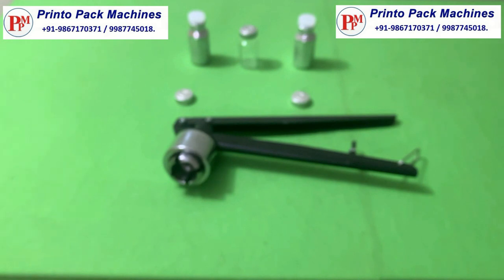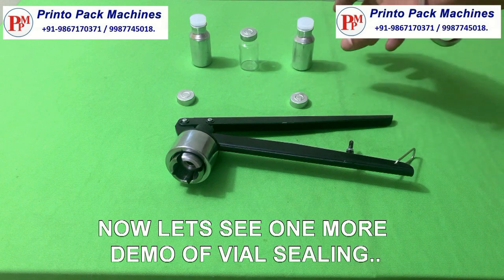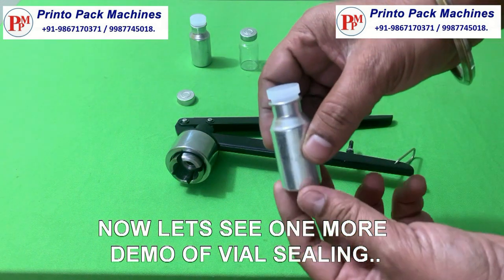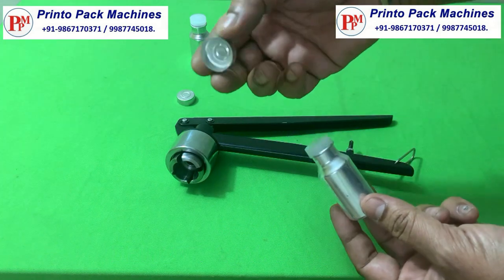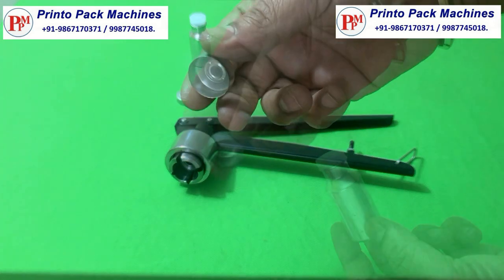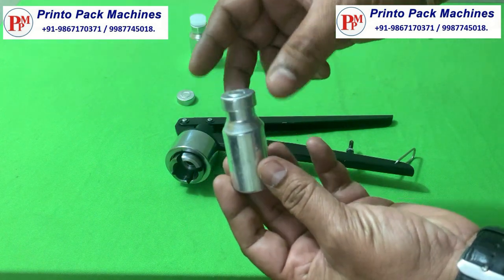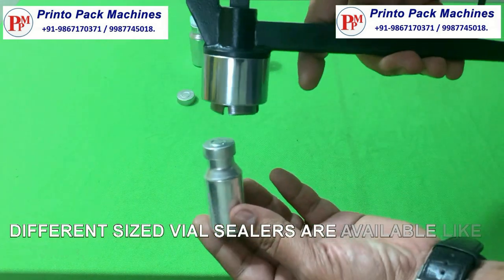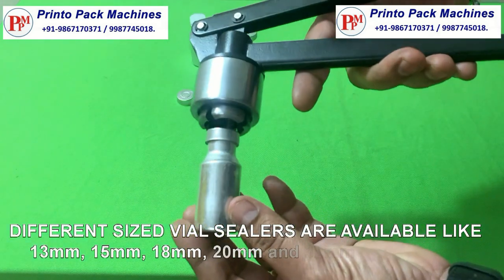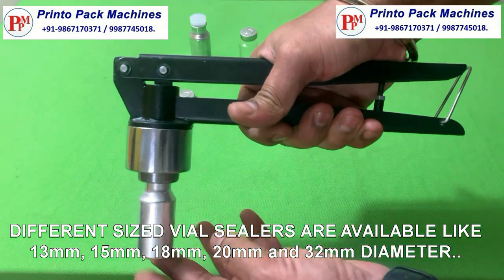Now let's see one more demo of vial sealing. Different sized vial sealers are available like 13mm, 15mm, 18mm, 20mm, and 32mm diameter.